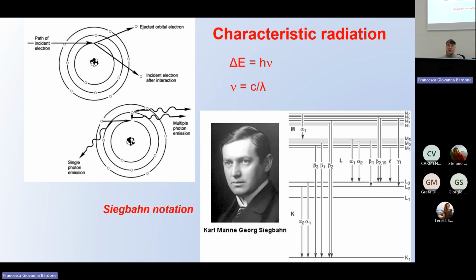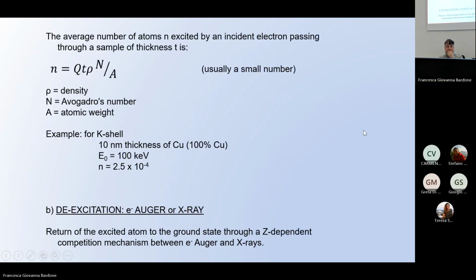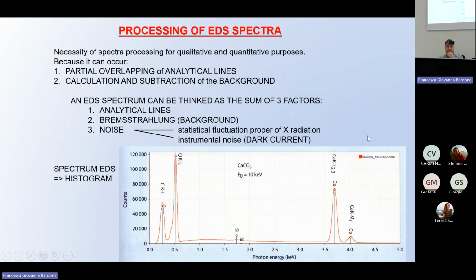You just measure the X-ray energy, and you know which elements, or how many elements, are inside the sample. Very, very easily. So not only the morphology, not only the backscattered electrons, but also the chemical information from this part of the instrumentation. I skip this.